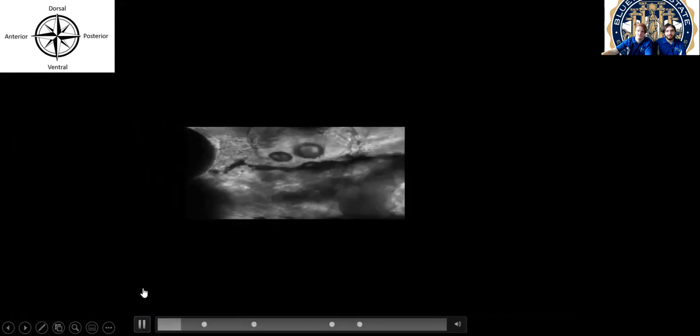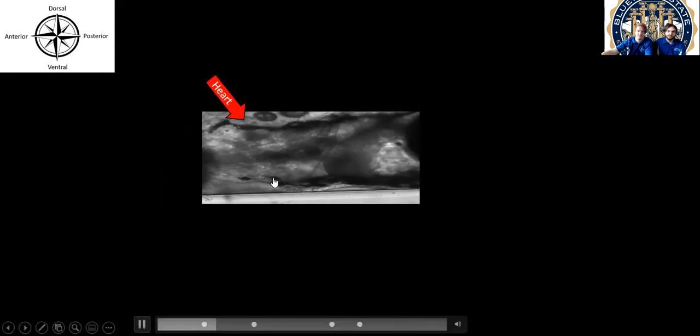This movie is of a larvae in our new chamber, version 4. Liquids are run through the Mitos pressure pump into the chamber. It is important to keep the larvae healthy and alive while in the chip. We can see this proof by movement of the blood through vessels and by the heartbeat, shown here.